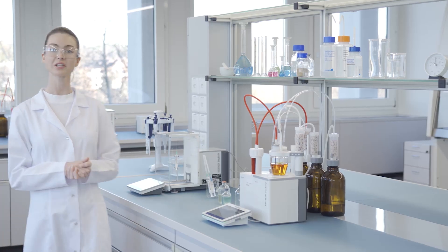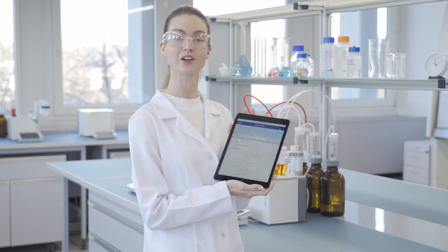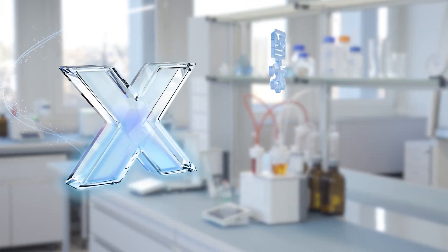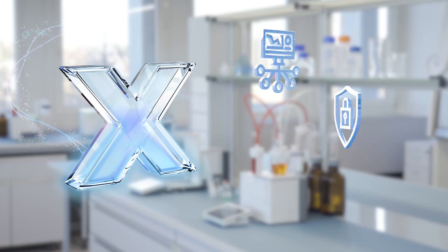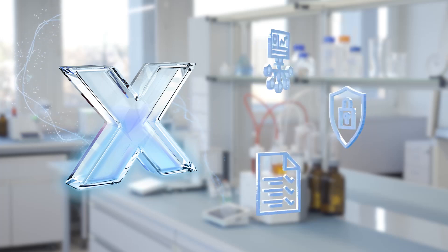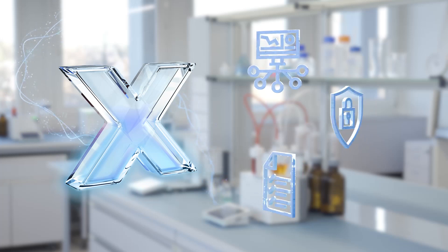How would you like to manage your data? Go digital. With LabX, you can access your information anytime, any place. You can streamline your data management, improve data security, and ensure regulatory compliance. You can focus on your work with complete peace of mind by integrating LabX software.